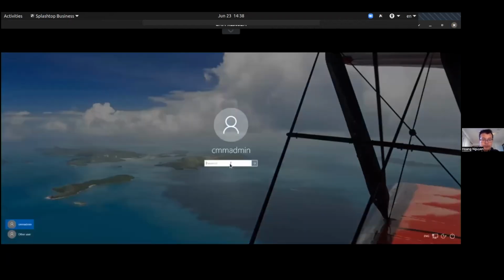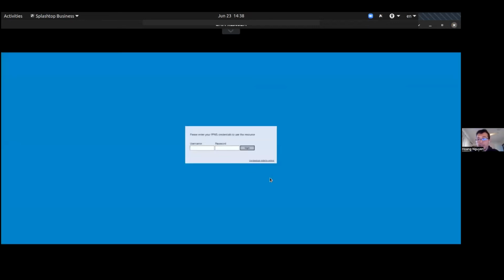The machine is XL30, and before this session, I already made the booking for this machine for an hour for the purpose of the demo. This is the tracker login. This is present in all the computers with Pitschi in it, and the user needs to log in using the UQ username and password.